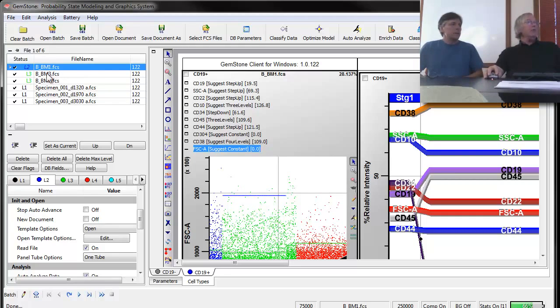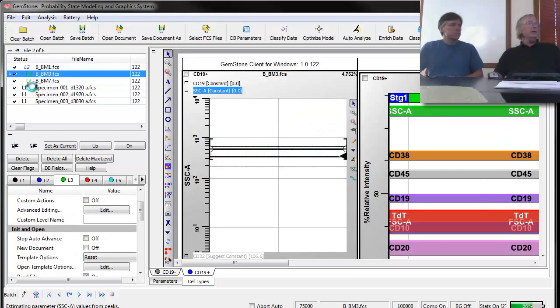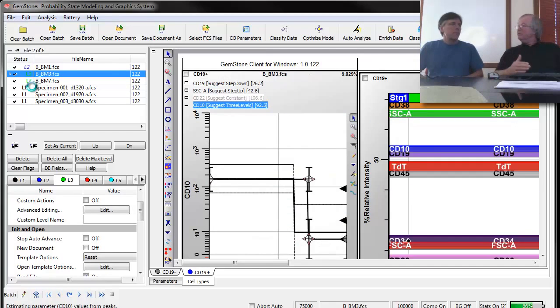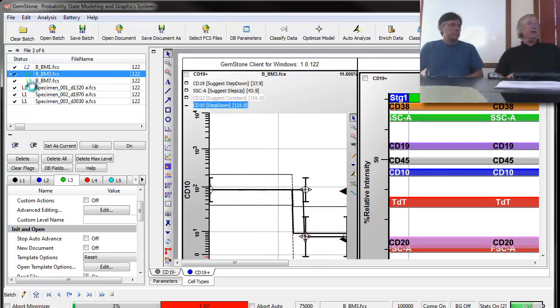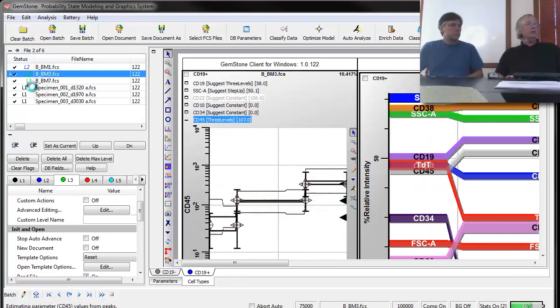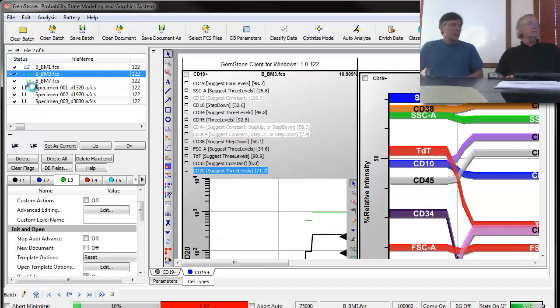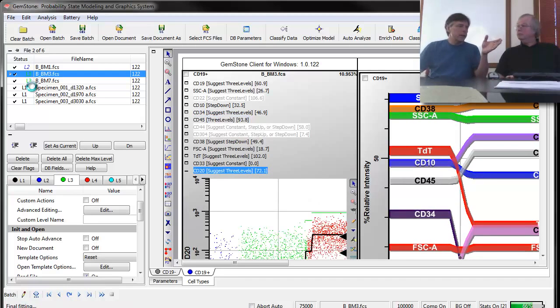Fast. But now we go, all right, so let's go ahead and analyze the next file. It does the reset now because it's on level 3, and now it's finding all the exact transitions for this file. So I could press one of the buttons on the toolbar at the bottom and just walk away from this, right? We don't have to sit here and watch this do this.